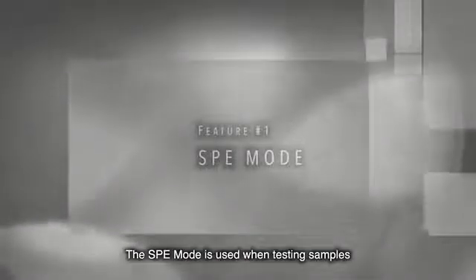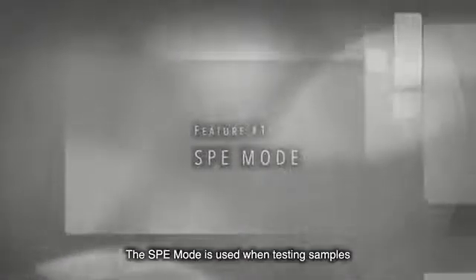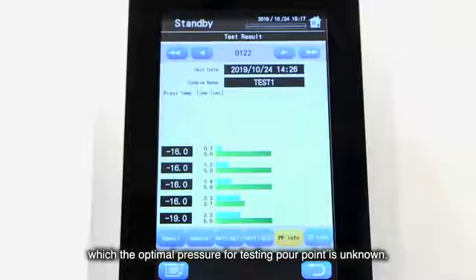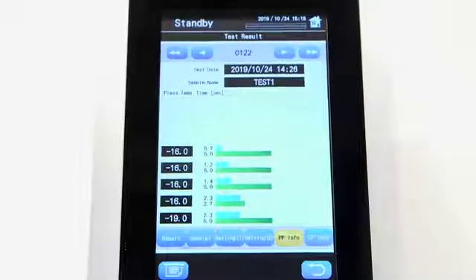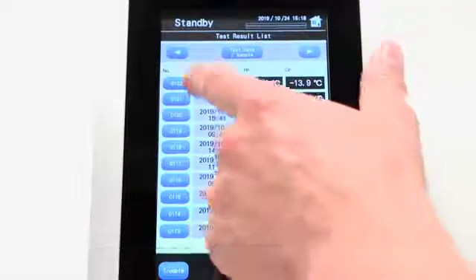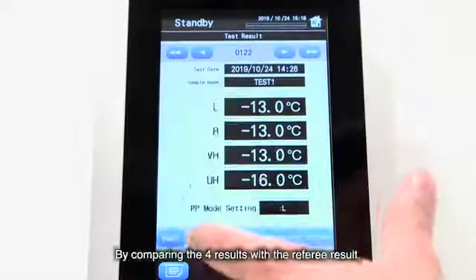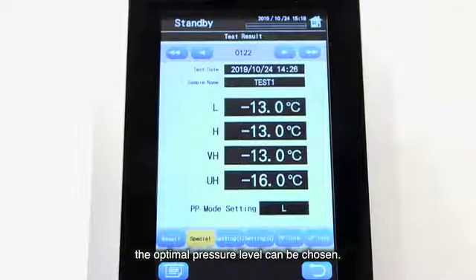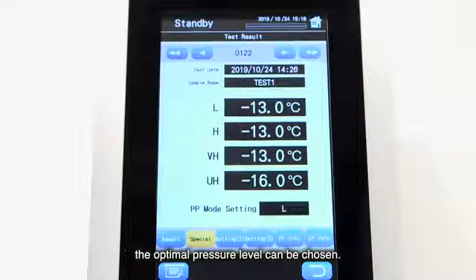The SPE mode is used when testing samples which the optimal pressure for testing pour point is unknown. When using this mode, the instrument will test at four different pressure levels automatically and give four results. By comparing the four results with the referee result, the optimal pressure level can be chosen.